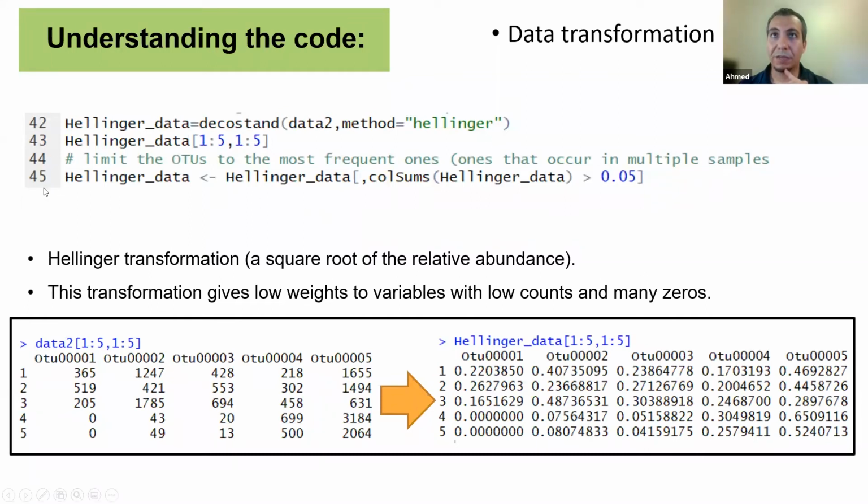This is something, again, from the Bowman Lab, the code that they had. Because they have looked at their data, they were seeing that, well, if we have anything that has a relative abundance below 0.05 after this transformation, they are going to remove that completely. So they are just cleaning their data, removing anything that is rare in their data set and just focusing on the abundant taxa.